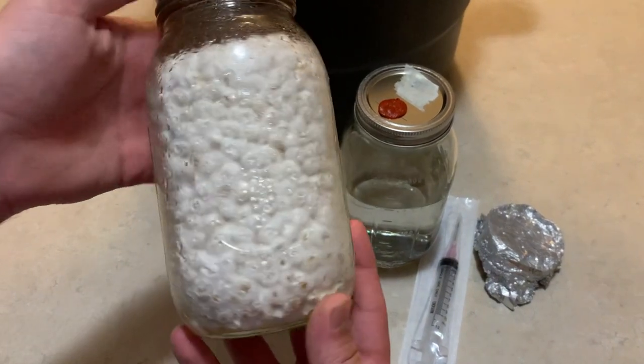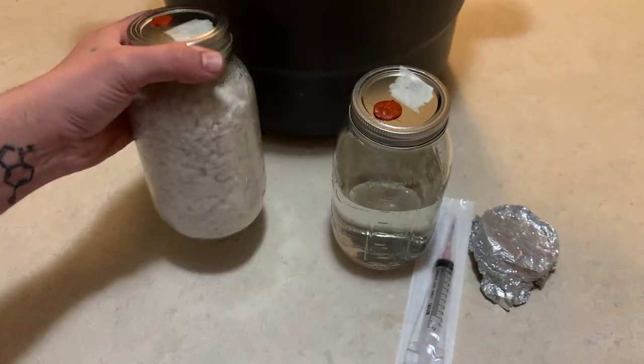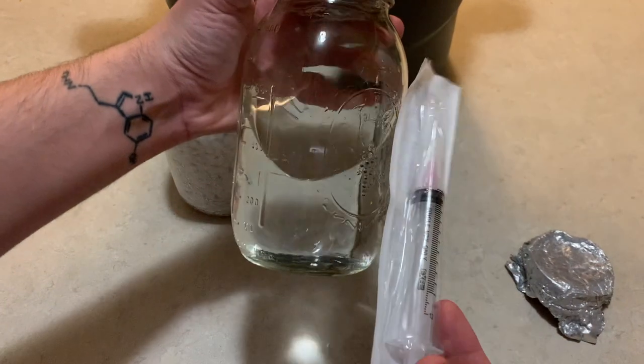Welcome back to Sporn Sprout. In this video I'm going to teach you how to make a liquid culture syringe from a fully colonized grain jar.